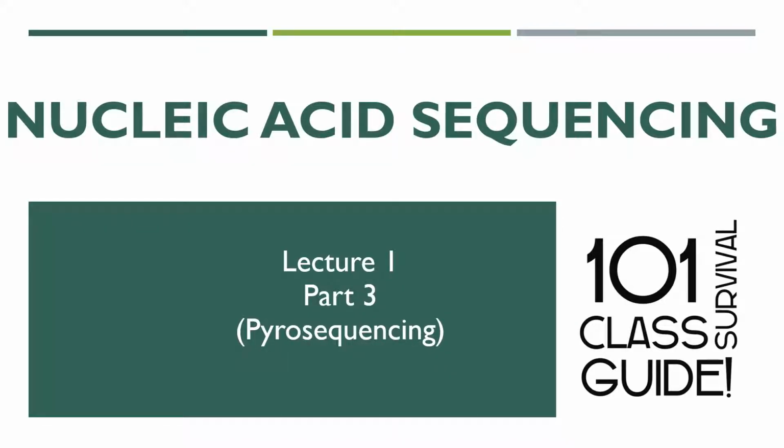Everyone, this is 101 Class Survival Guide and today's lecture is going to be about pyrosequencing.